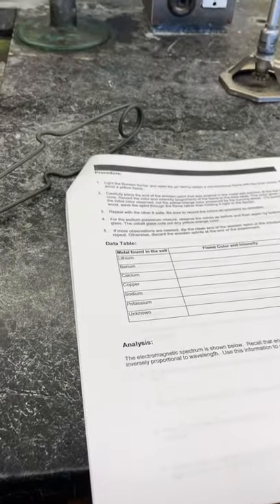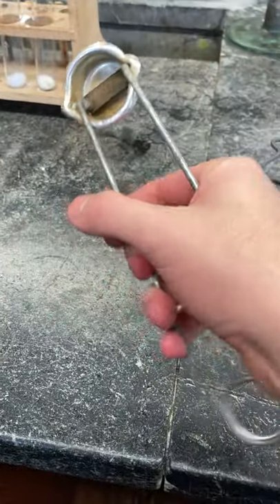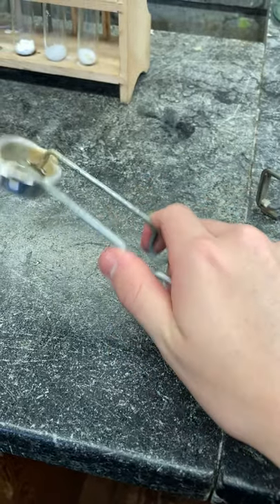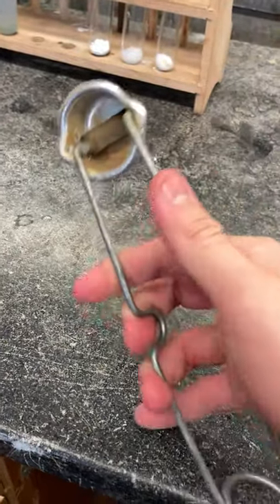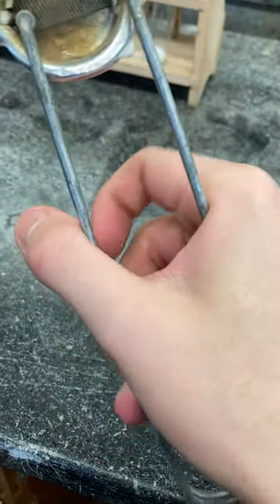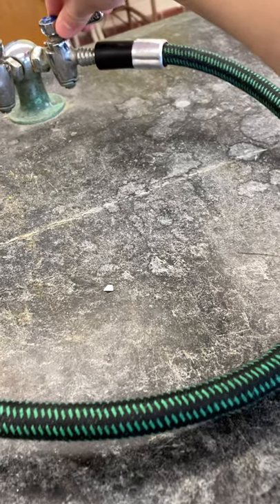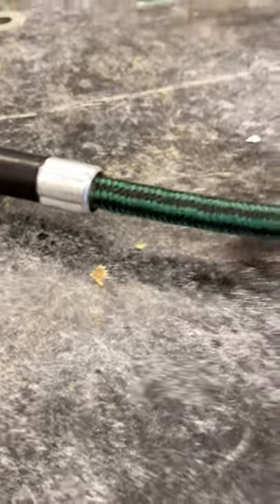Light the burner, open the air vent. Okay, so you're lighting the burner this time. You light it. Why? I can't do it. Turn it on. Ow, that actually hurt. Nothing's happening. Oh my gosh, I hated this. Alright. I hear that. I don't like hearing it. Oh wait, now we spark it.